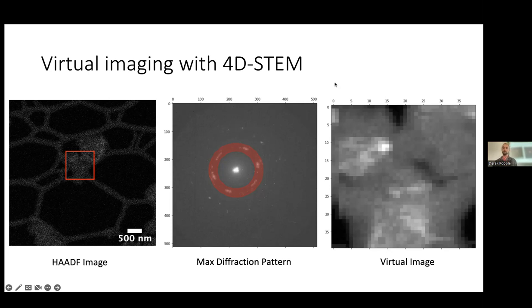But other features that you can see, based on the varying intensity, are in certain regions where we have more scattering. That could be either a thicker crystal or potentially just a denser region of crystallites that's causing stronger diffraction. So what we're hoping to do is locate some of these zinc soaps in an oil paint and then acquire a higher res 4D STEM scan and start to correlate using the diffraction. So we can figure out, okay, this is actually the material that we're interested in, but then also start to gain insight into the orientation or how there are changes across the scale of a single crystal.